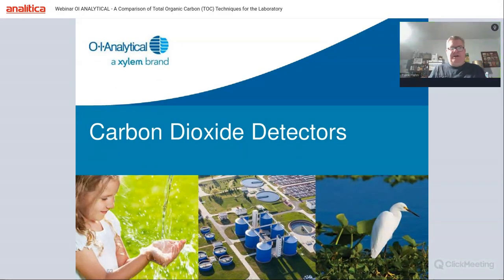Now we'll touch on carbon dioxide detectors. There are three choices with carbon dioxide detectors: non-dispersive infrared detector, conductivity, or membrane conductivity.